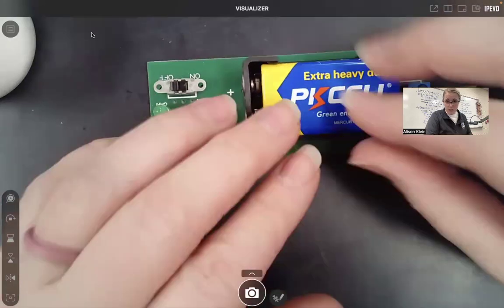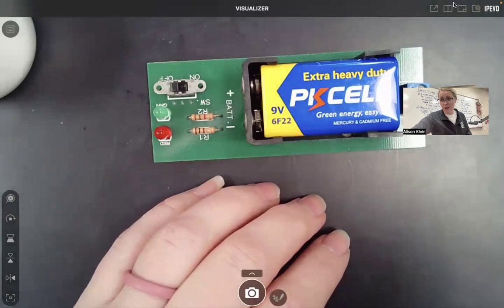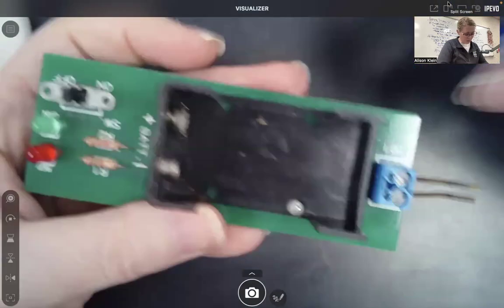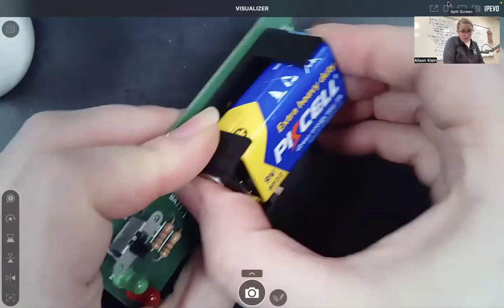You will go to the conductivity tester. The conductivity tester does not come to you. That way, everyone always has access to it. So this is my conductivity tester. The first thing I'm going to do is make sure that the battery's in it. So I'm going to put my battery in my conductivity tester and click.